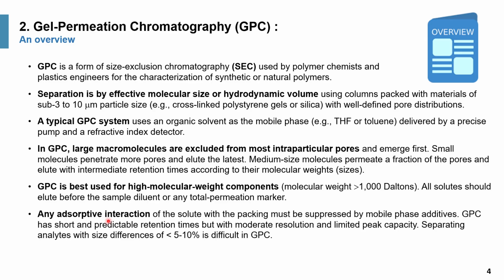It's very important in GPC, in the method development portion of it, to eliminate any adsorptive interaction of the solute with the support. Otherwise, you will not get a true molecular weight correlation. So it's very important to eliminate any active site interaction using mobile phase additives.